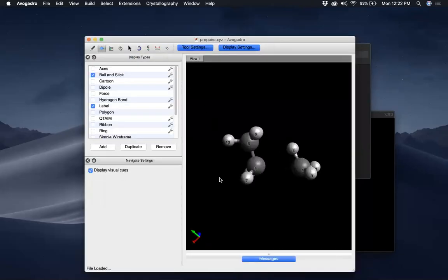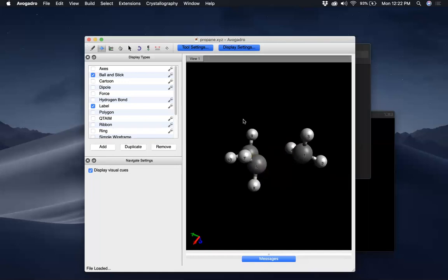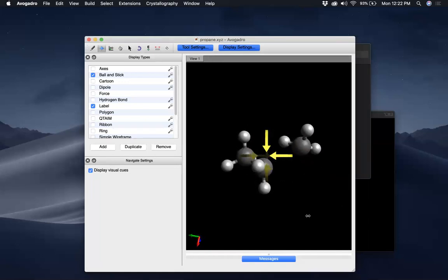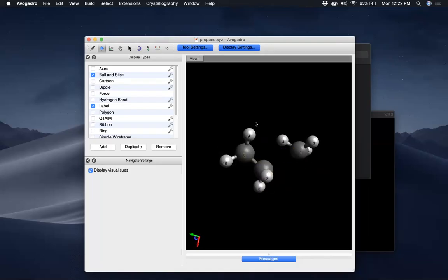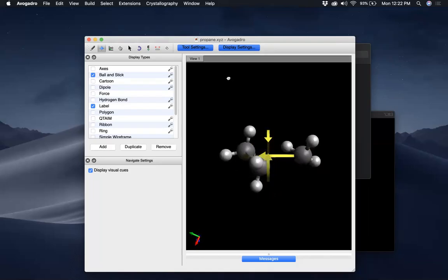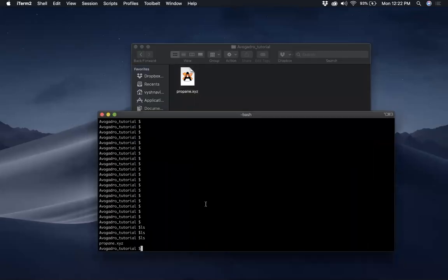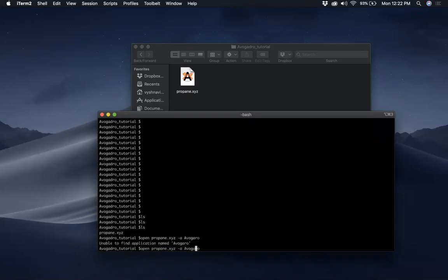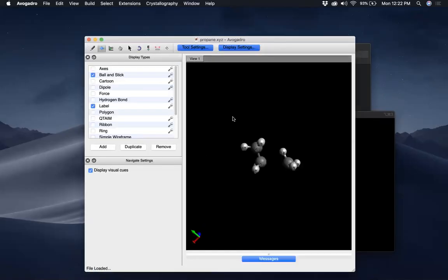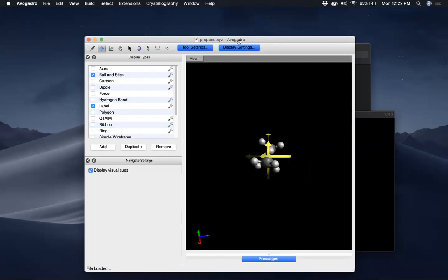If you want to open an XYZ file, you can just double-click it and it shows — of course it doesn't show the bond here because the bond length is too large, but we know what to do with that, so that's fine. If you want to open a file through the command line, you type 'avogadro propane.xyz' and you can open the file in Avogadro.